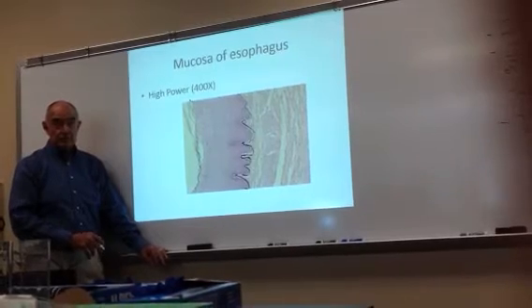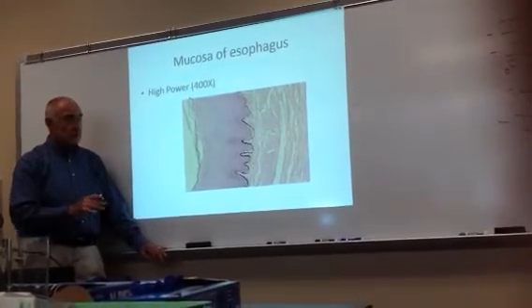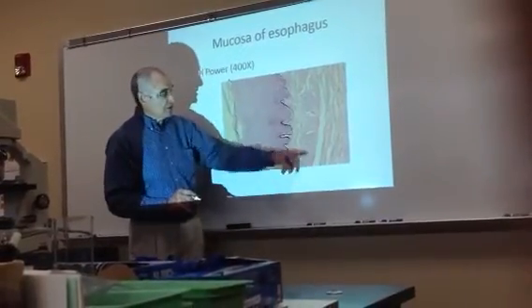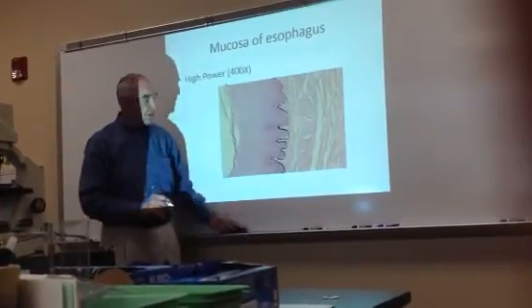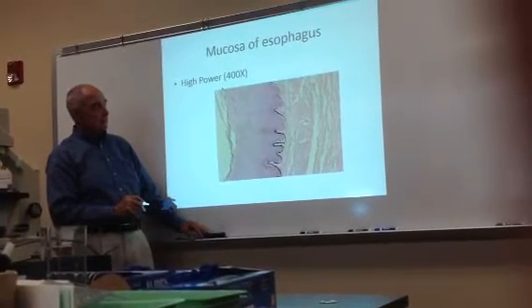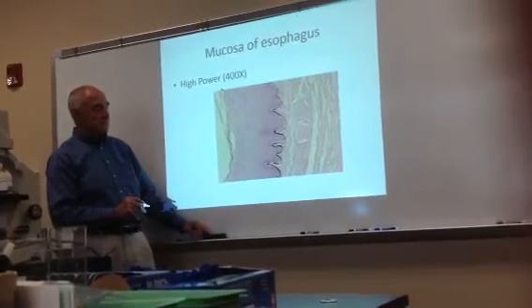Areolar connective tissue, remember it's always very loose, like spider webby type stuff. And interspersed in it, here's a big blood vessel that they've called a cross section of there, or a longitudinal section. So a lot of times you can see blood vessels in the submucosa.